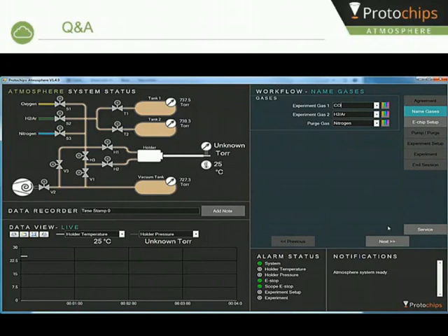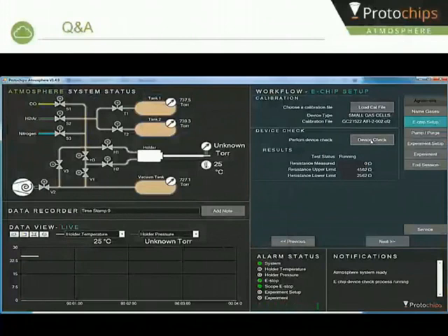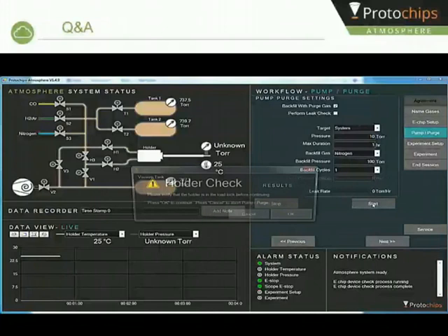Regarding FIB, FIB sample prep can absolutely be done with our system. FIB is an increasingly popular technique for sample prep. We have several customers that use FIB for all of our products, Enduro, Atmosphere, and Poseidon. Customers use both in-situ and ex-situ lift-out procedures to mount FIB specimens on the heating membrane. The main concerns are those common to all FIB prep, for example, gallium implantation into the sample and the impact that has on imaging and analysis. But absolutely, FIB is a useful technique for our system.